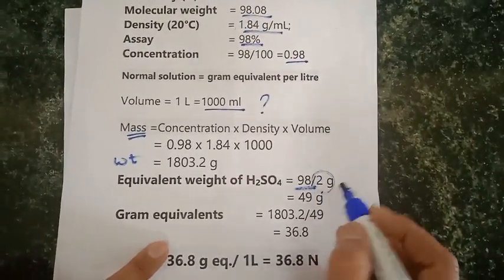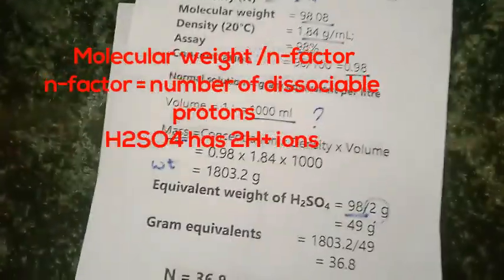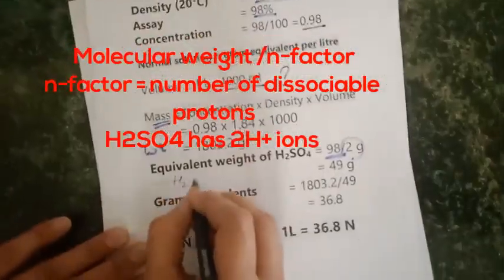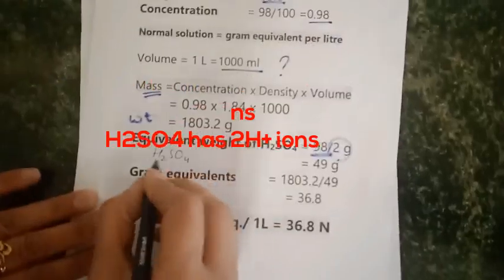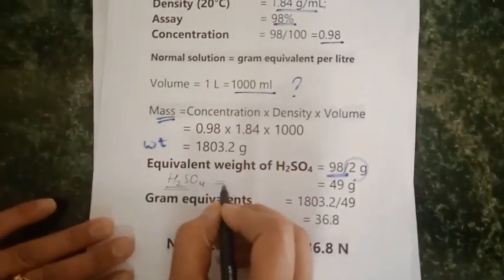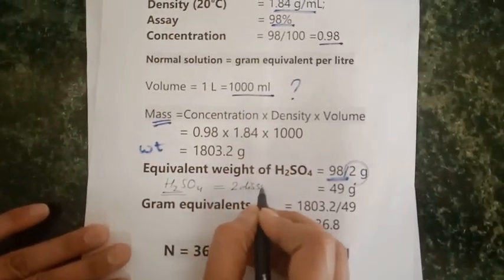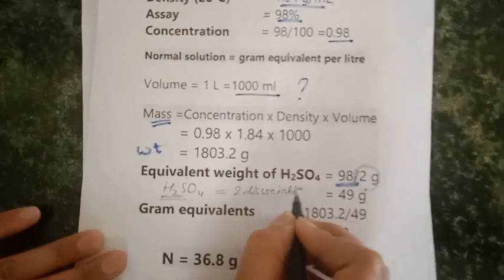How we can calculate n factor for H2SO4: this H2SO4 has two dissociable protons, therefore its n factor is 2. So 98 divided by 2 gives us 49.